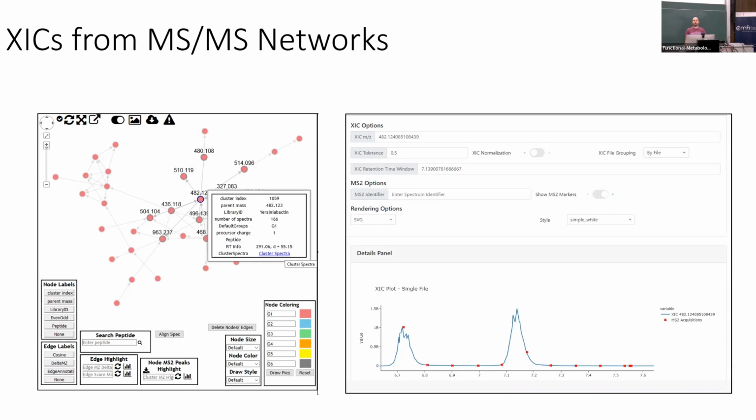And that is really important because it gives you so much more information than just this reduced network view. So again, this was a classic molecular network. So we did not do any feature finding there, but only looked at the MS-MS, which comes with a couple of caveats. And one of those is perfectly displayed in this XIC.